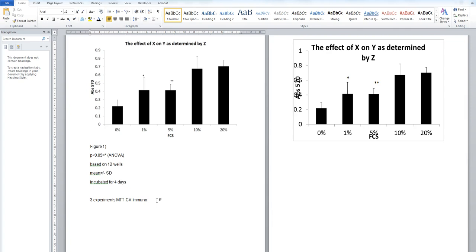And I want everyone to use 3 sets of good data. That's why I've put crystal violet, MTT and immuno data online. Everyone got something to work, but most of you only got 1 or 2 things to work. So supplement your rubbish data with some good data from me. So I think that's probably everything you need to get this thing written up. Good luck.